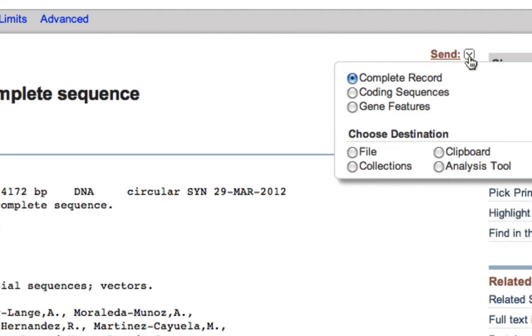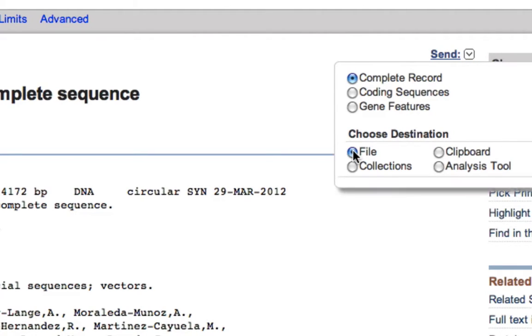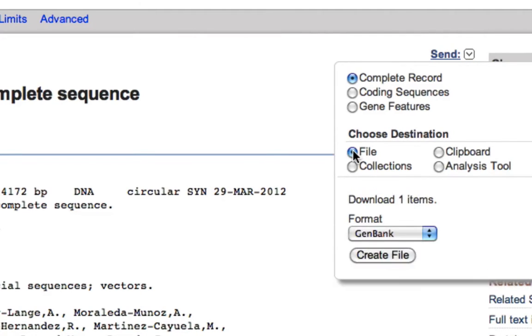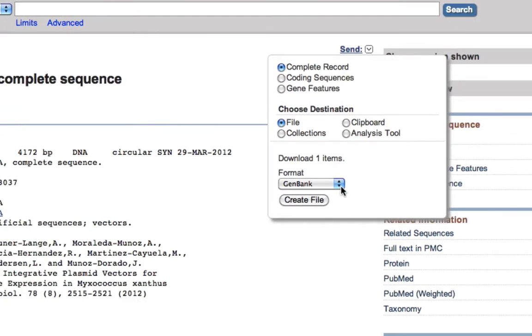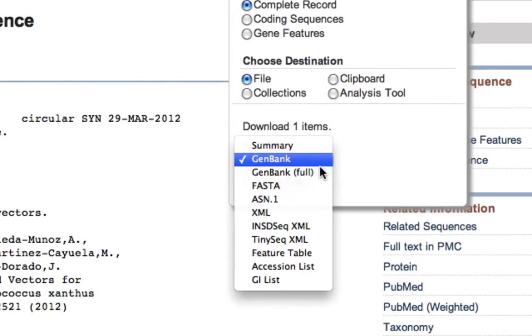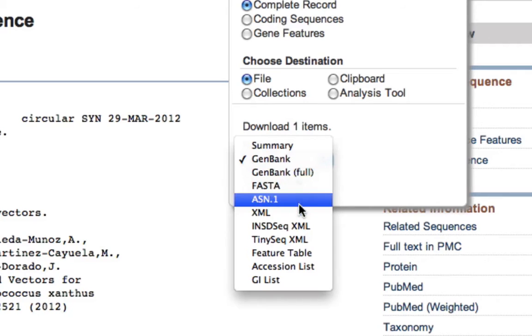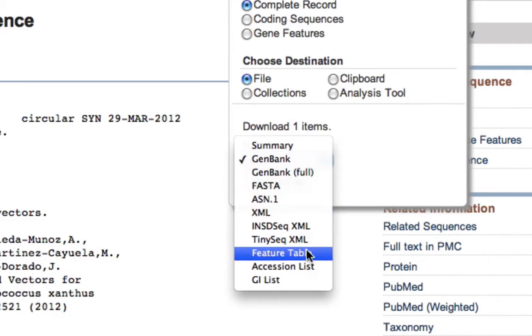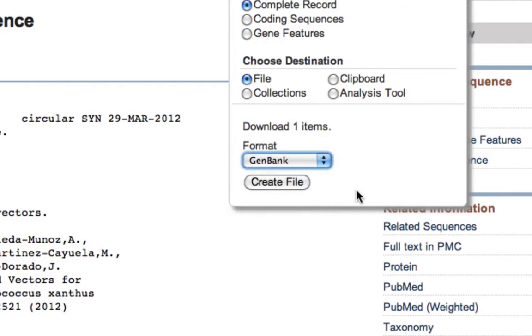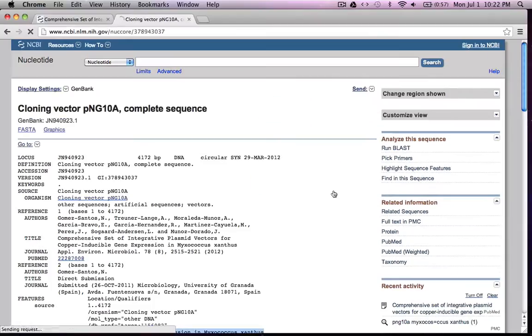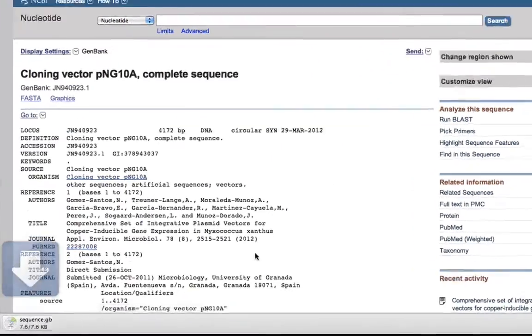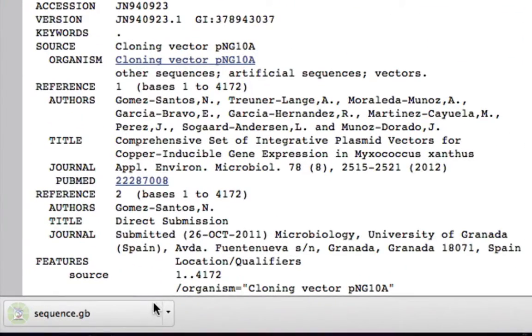On the top right corner, go to the drop down menu of Send and then choose the file which can be in the format of GenBank, FASTA, XML, etc. I'll choose GenBank file, hit create file. That will download the GenBank .gb file.